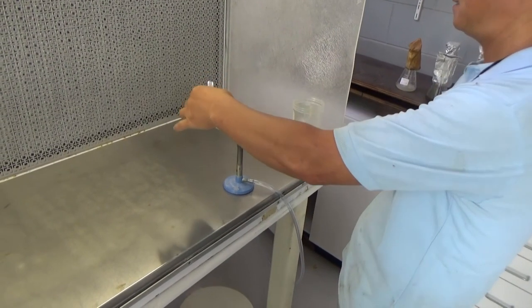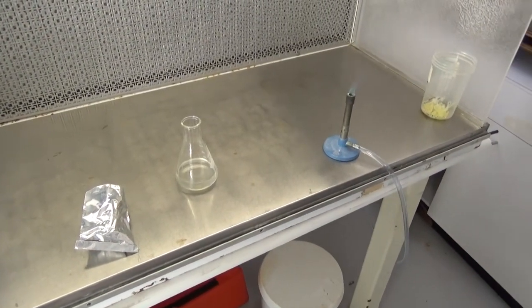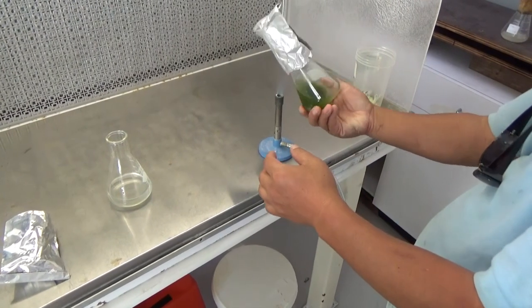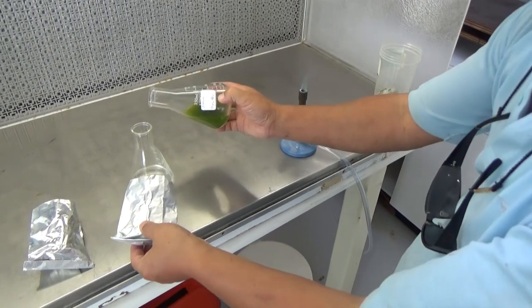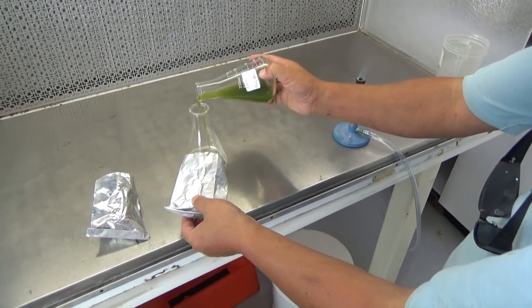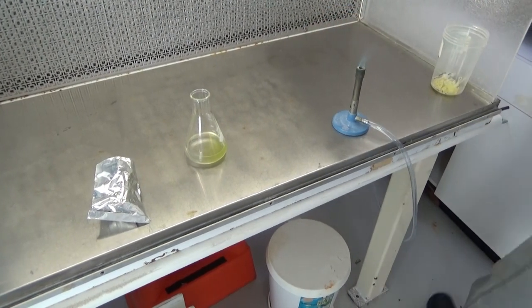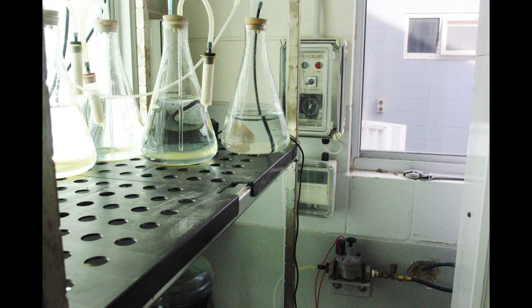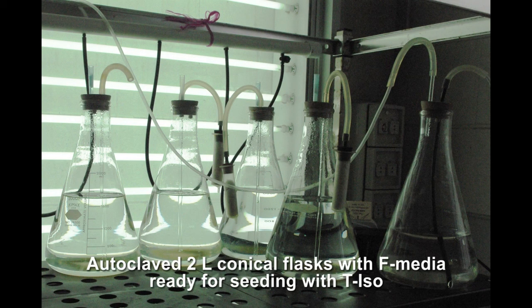Same procedure. Aeration with carbon dioxide injection is provided to all working cultures. 2-litre conical flasks, 10-litre carboys, and 300-litre bags. These autoclave flasks are ready for seeding with TISO.